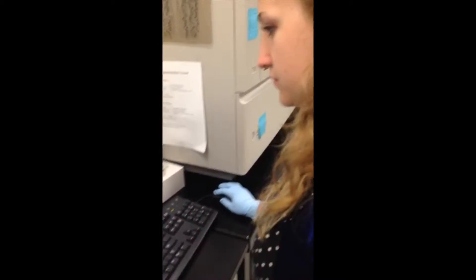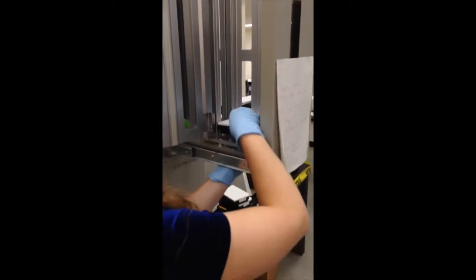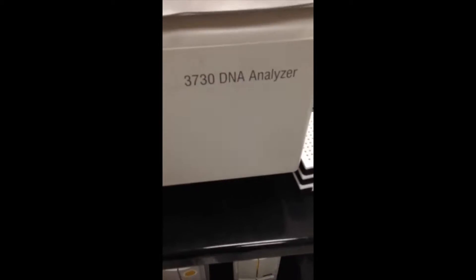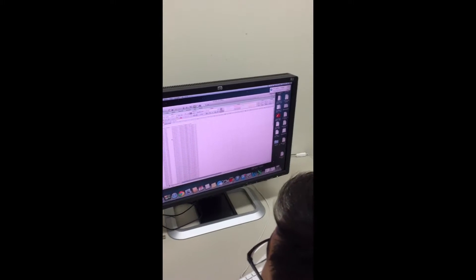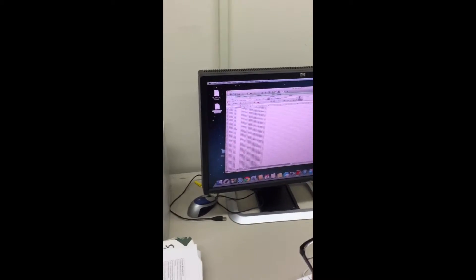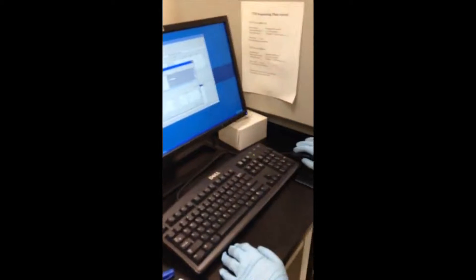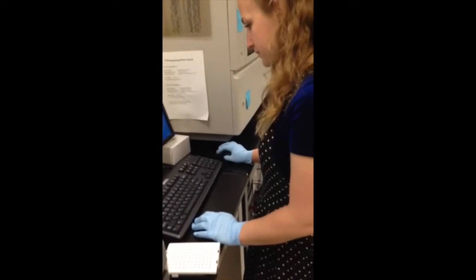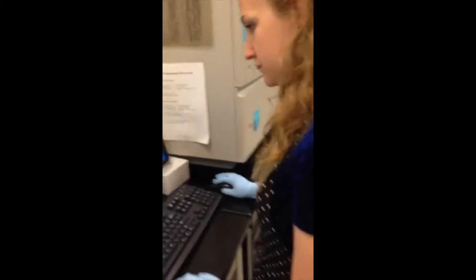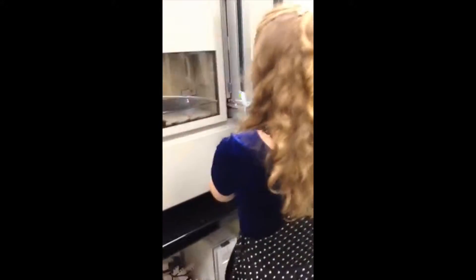These containers are similar to the ones that contain the buffer and water that the 3730 uses. Before you use the 3730, you need to make sure that the buffer has been changed for the day — how you can tell will vary depending upon the lab. Before we can run our plate, we need to make a template. We go to a computer, select an Excel program, and design a template specifically for whatever part of the genome we are working on. This allows us to tell the 3730 what it's running, and all the data gets collected in a set that is easily transferable to Geneious, which is the program we use to read the genomes.